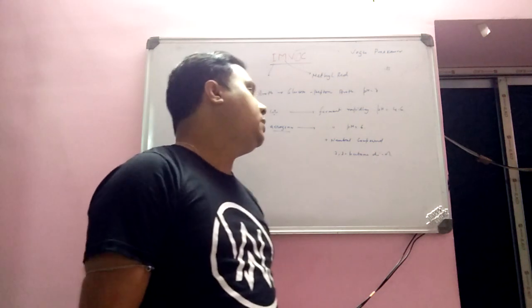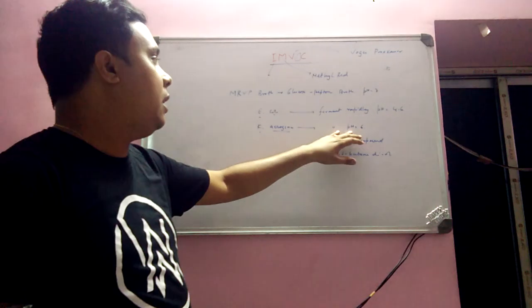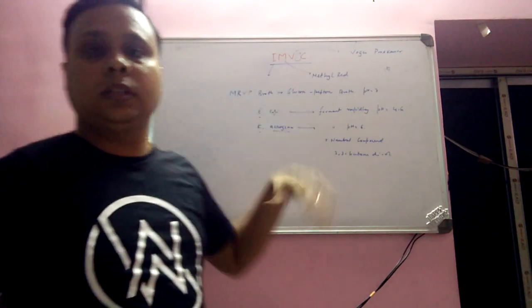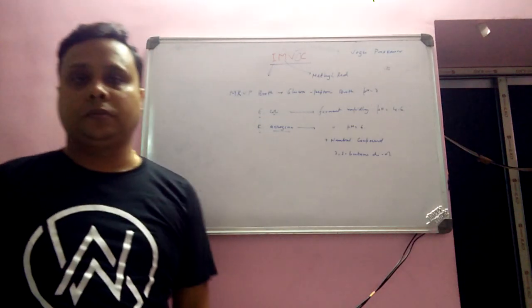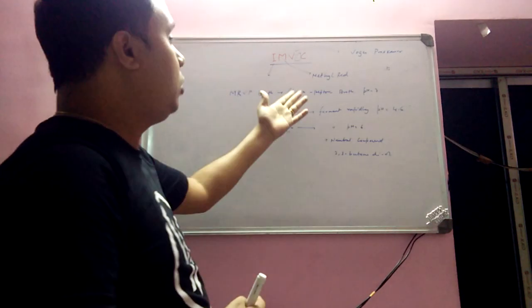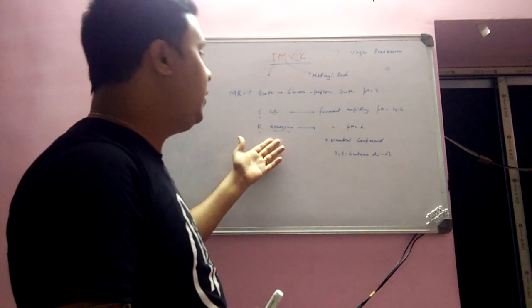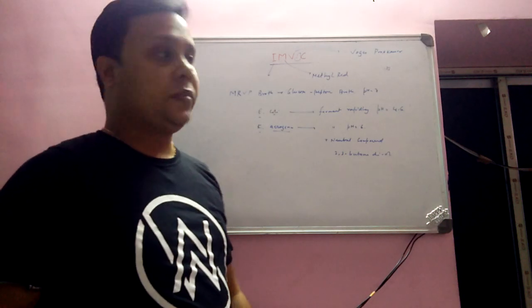That is why their pH decreases from 7 to 6, and at that pH they are capable of utilizing the whole glucose present in the media, and after utilizing the glucose they next attack peptone. That means E. coli cells cannot use the total glucose present in the media, while the non-fecal coliform can use the total glucose and also attack the peptone molecule.